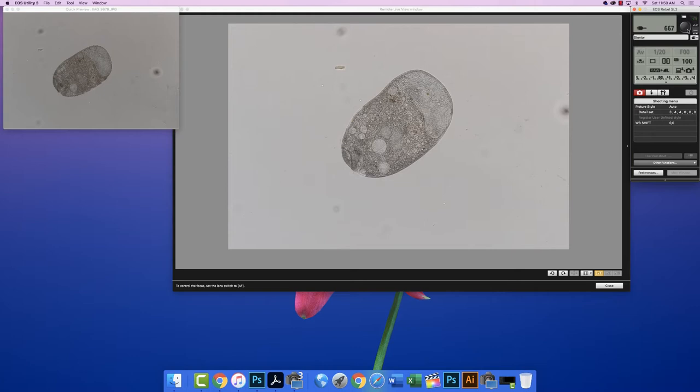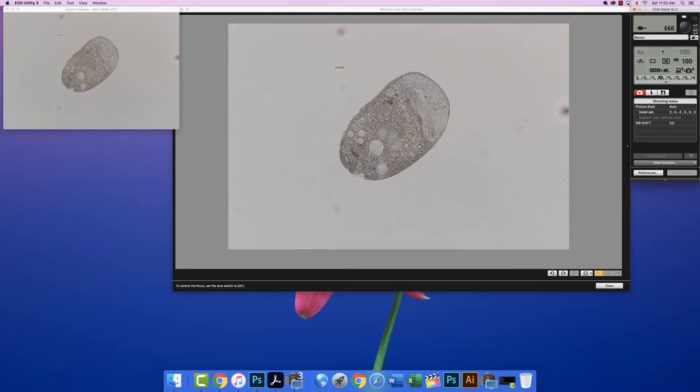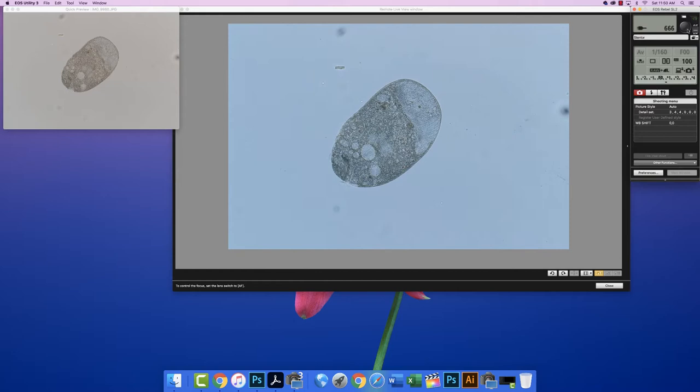And now again at 10x, I just realized that my shutter speed again is low, 1/20. So I'm going to increase the power so that I can have a faster shutter speed. Whoops, let's go down a little bit. There, 1/125. I'm going to open the door.